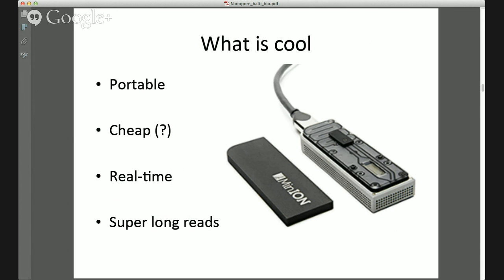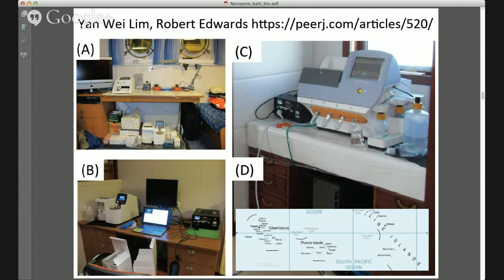Actually, Matt Loose, who's going to talk after me, is going to give a much more visceral demonstration of that, I hope. And clearly the reads have been promised to be long, and they are long. Now I should just say, for balance, that there are examples of portable sequencing already.